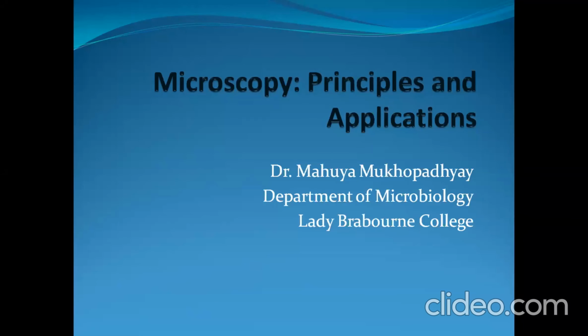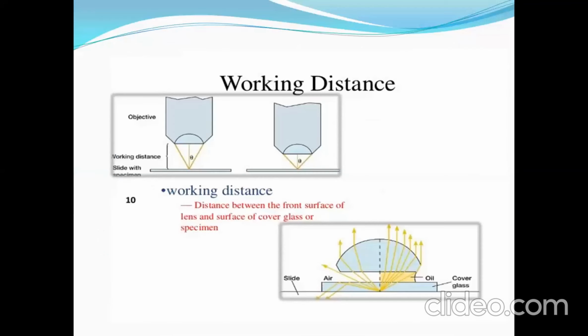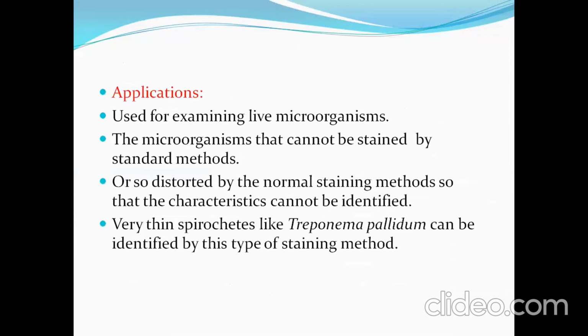We have learned in great detail about the bright field microscope, mainly what the parts are, and the function of the different lenses. We dealt with the magnification and the resolution part, then passed on to dark field microscopy, and finally fluorescent microscopy. We learned in great detail the function of the excitation filter, dichroic mirror, and also the emission filter. But there was a little doubt about the number of filters used there. So I have something to share with you.